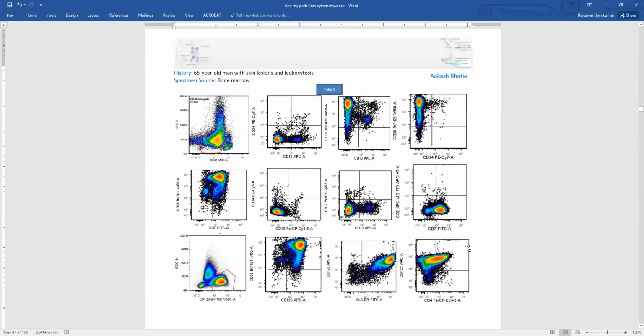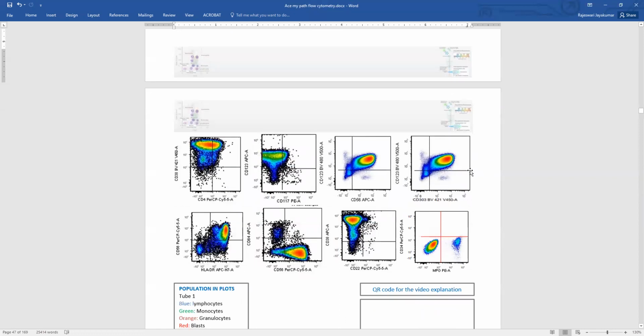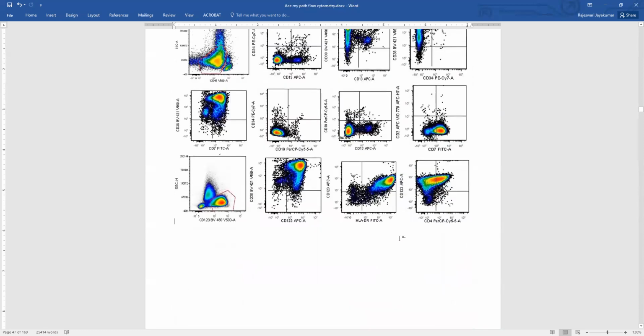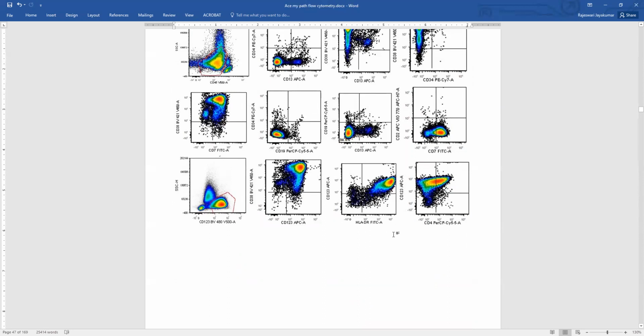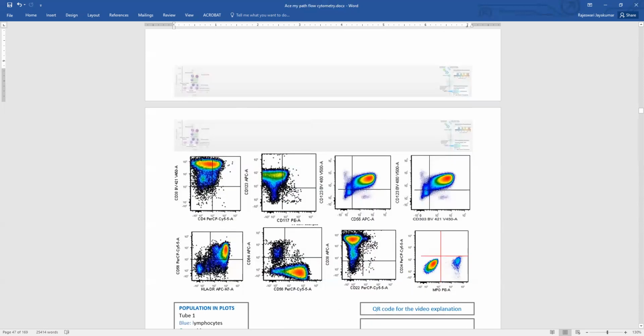So now let's see what they are positive for. They're positive for CD123, CD56, CD7, partial CD4, HLA-DR, and they are positive for CD303, and they are negative for MPO. So myeloid specific markers are negative, and they're negative for B cell markers CD19 and CD22. They were positive for CD7, but we would also look at other T cell markers like CD3 and CD2, but that's not shown here. CD2 is shown here, but other T cell markers are not shown here. And they're negative for myeloid markers CD13, CD33, and monocytic markers like CD64, CD11b, etc. So not everything is shown here, but they were negative for all other lineage specific markers.